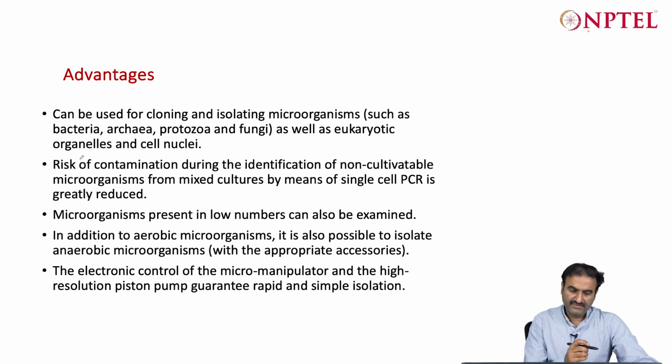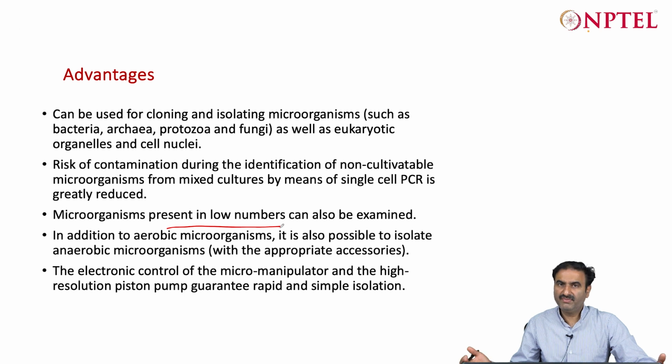Some microbes that are in very low numbers can also be examined, which may not get sufficient representation when you're dealing with the community together. In the case of aerobes it is easy, but in the case of anaerobes, where culturing is not possible or very tricky or requires a very tedious process, this can directly go for isolation and sequencing.